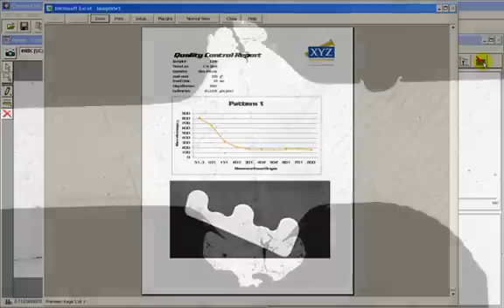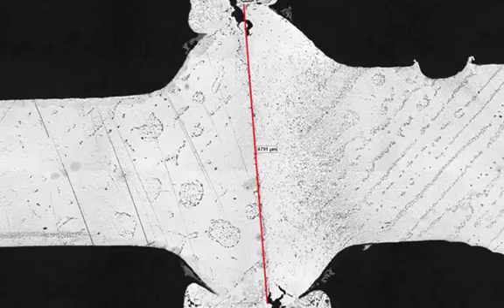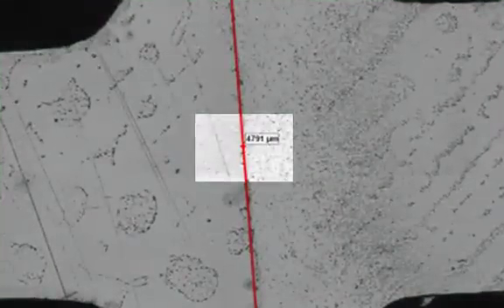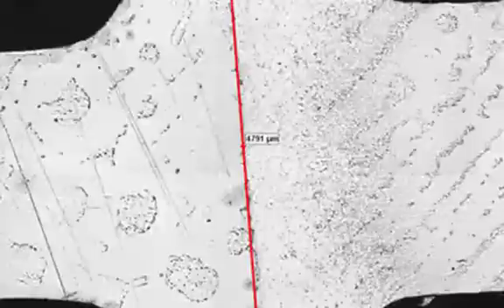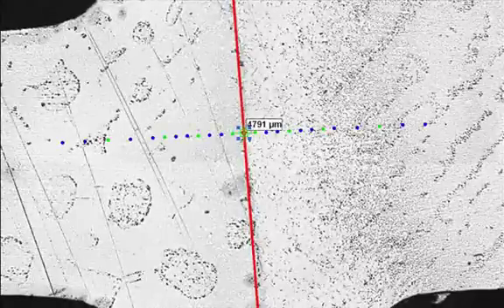In this friction weld example, a straight line was drawn to find the exact center of the part. A test pattern was created to measure hardness on either side perpendicular to the interface.